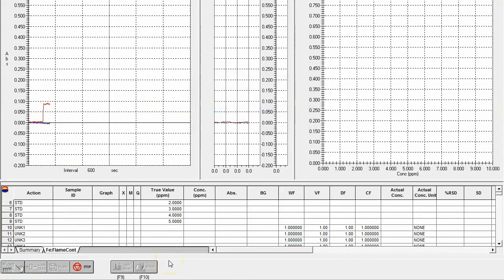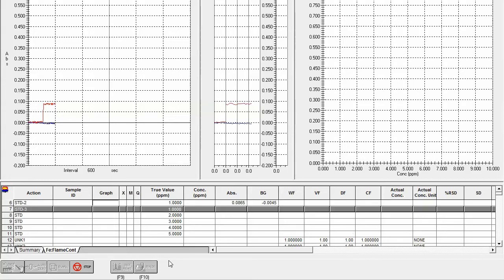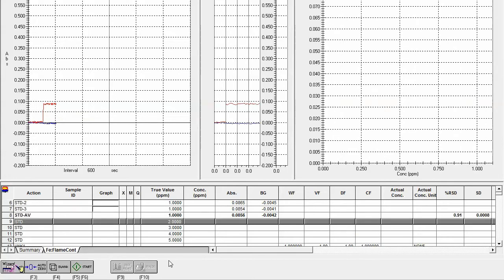And what it's doing now is taking those 3 measurements that we set it up to take. So remember we did spray, measure, measure, measure. So it's spraying the sample into the machine and taking 3 measurements. And as I mentioned in the intro to this lab, it's a pretty quick technique. Once everything is set up, you can see it's already done that first measurement. So that took a matter of seconds to give us 3 readings, and it automatically calculated the average for us.